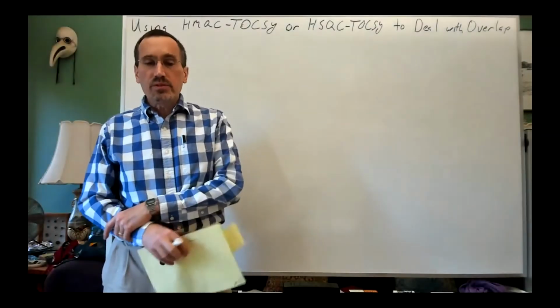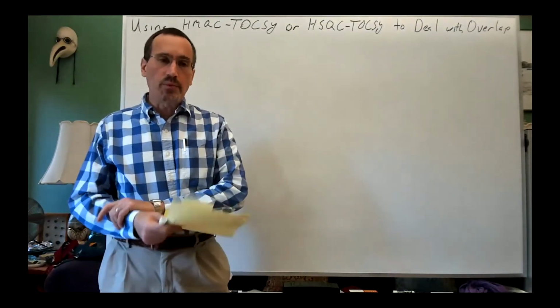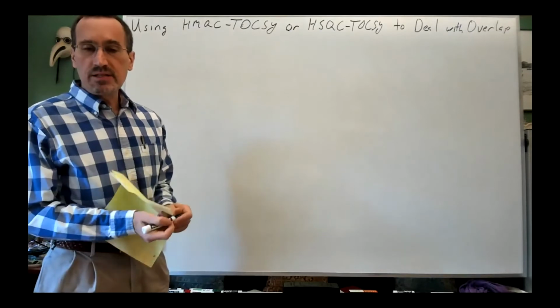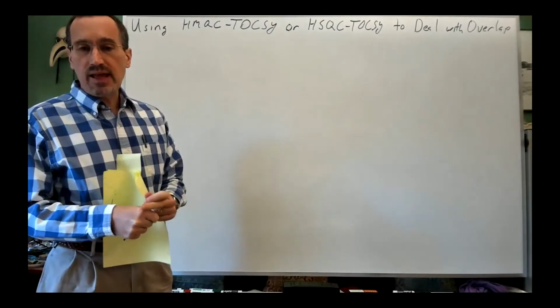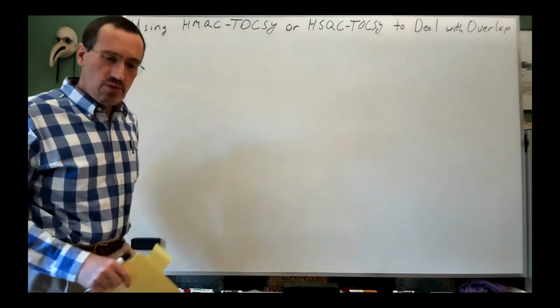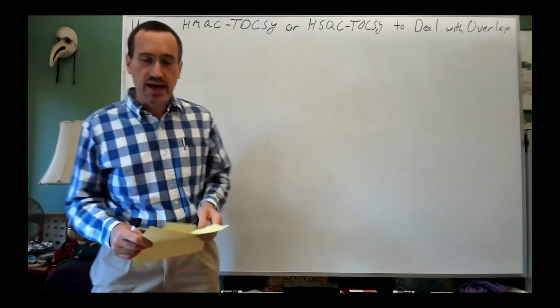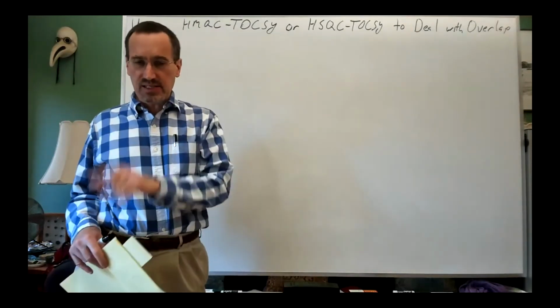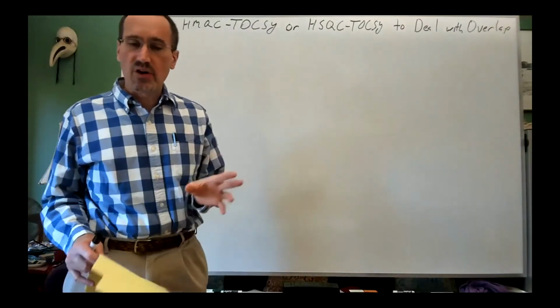Today, what I want to talk about is the situation of dealing with severe overlap where you just can't use COSY to trace your way through a spin system. So I was hoping we would have had the TOCSY problem last week but you have it this week. You're going to start your homework with this TOCSY-oriented problem where you're going to very nicely use TOCSY to pick out spin systems where you've got at least one resonance in the spin system that's distinct, and you can sort of pick out the other resonances even if there's a little bit of overlap.